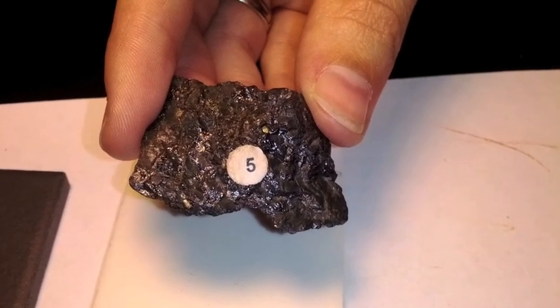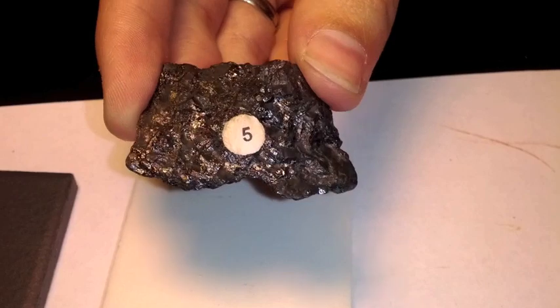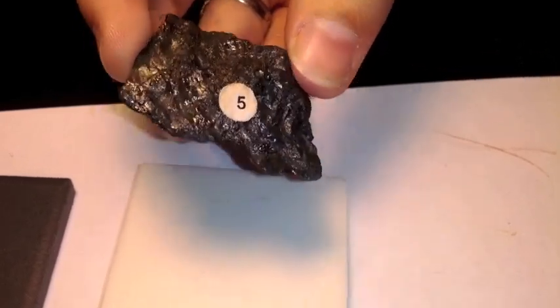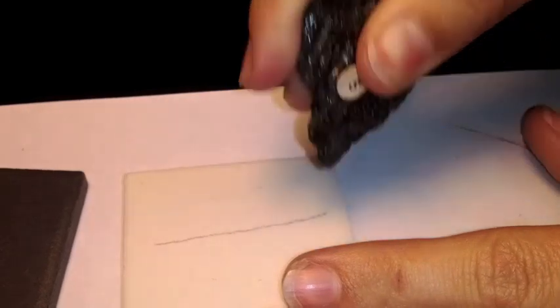This mineral is number five, it's called Magnetite. If you look at it, look at the color — it even has a shiny luster. It's more of a black mineral and leaves pretty much a black streak.